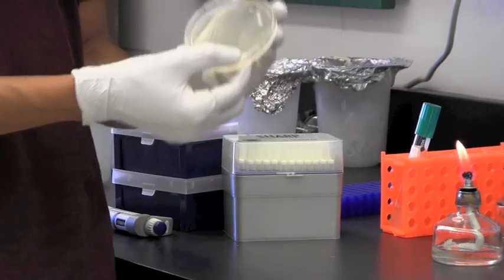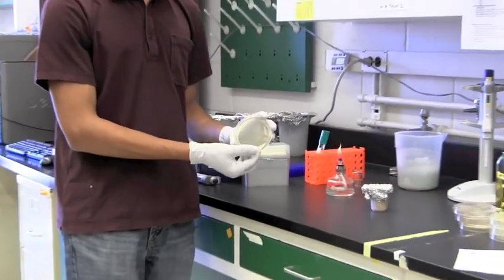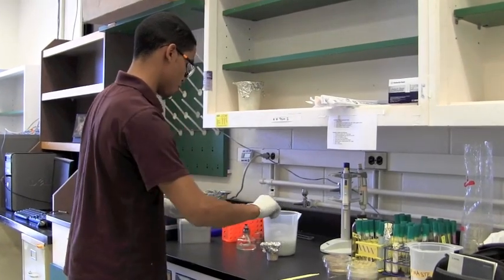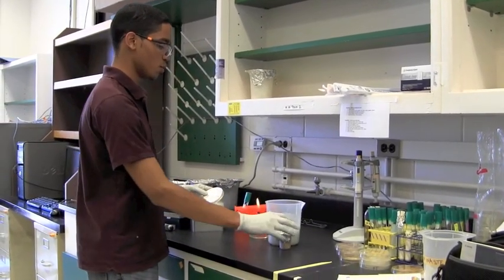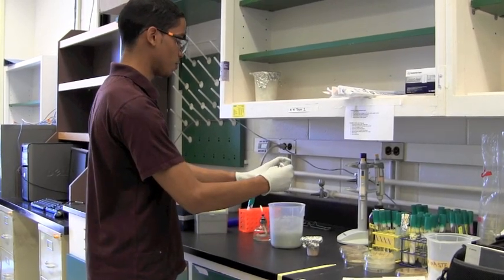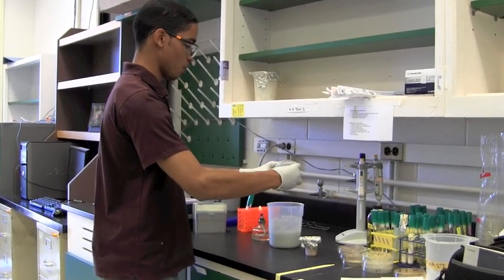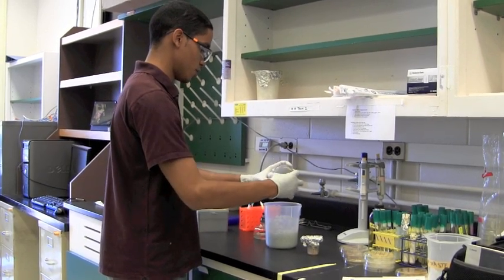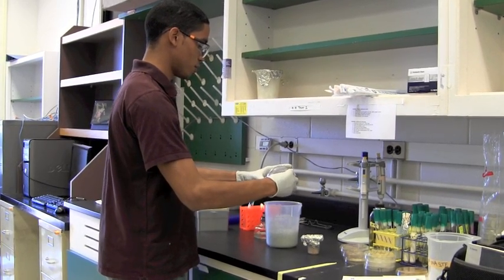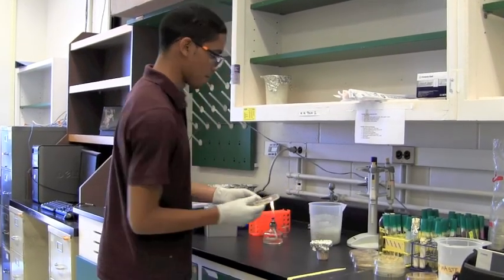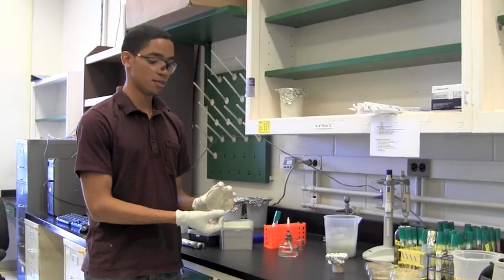And now that I've gotten a uniform layer of inoculum onto my plate, I'm going to carefully dispose of my beads onto a dirty bead container. Make sure they're all on the bottom on one side of the closed plate, and just carefully shake them off, trying not to contaminate my plate. And now my spread plate is ready.